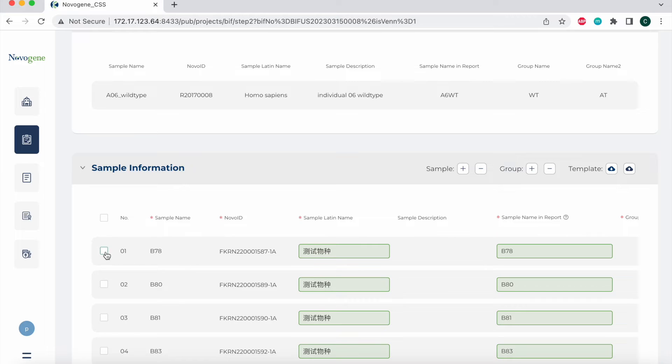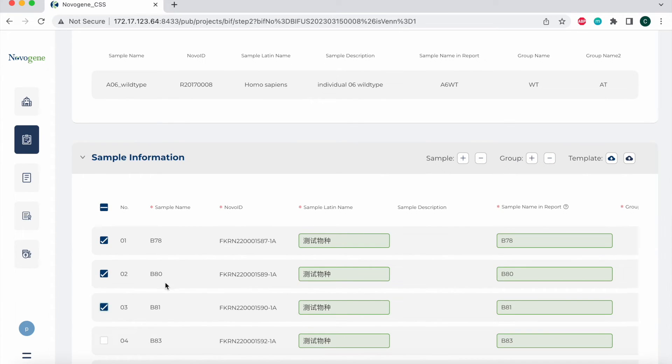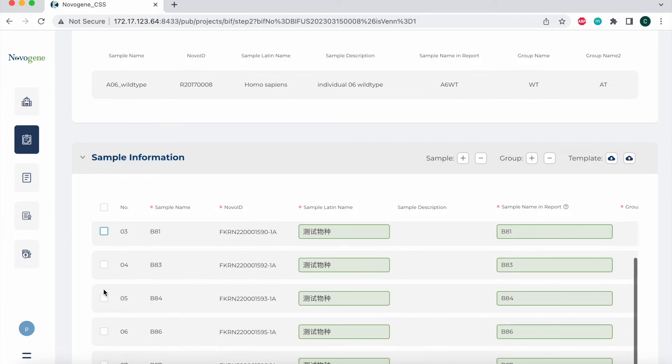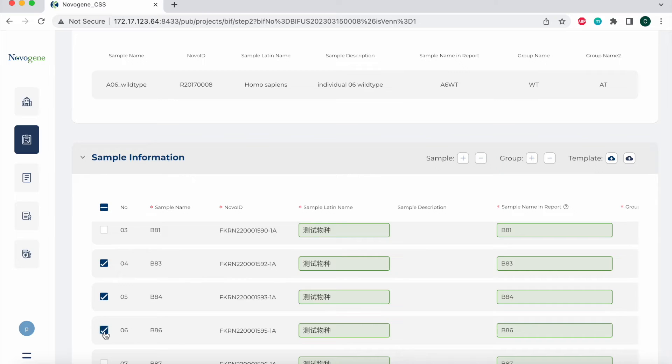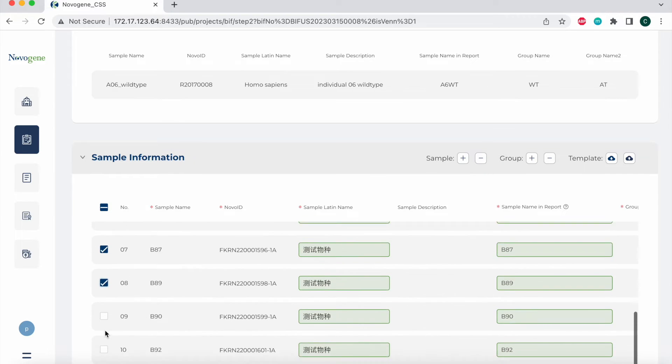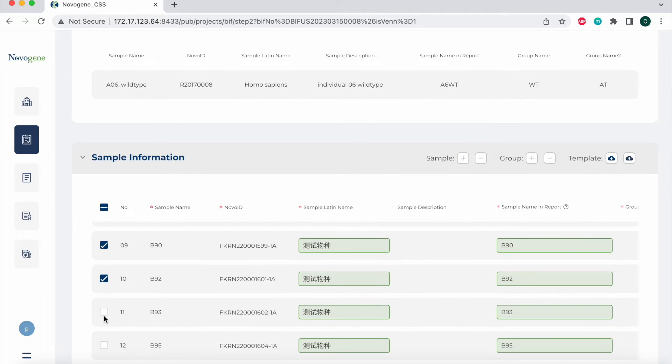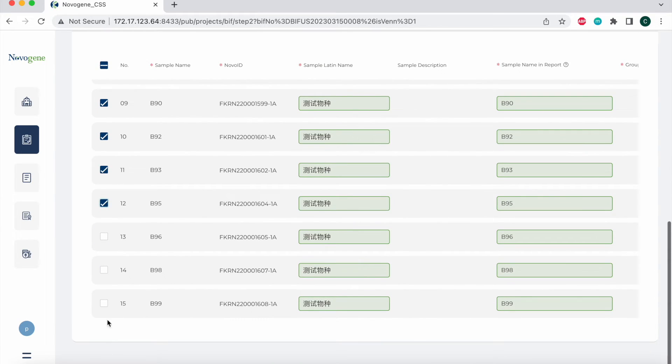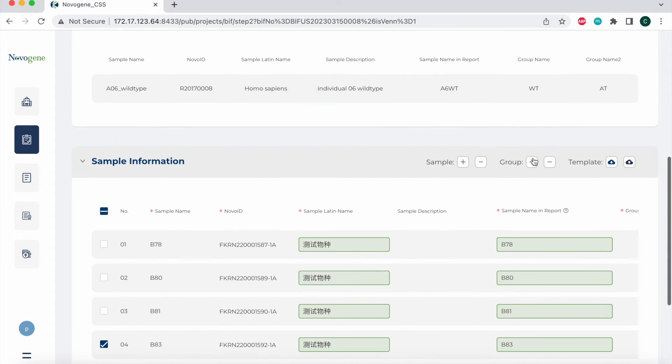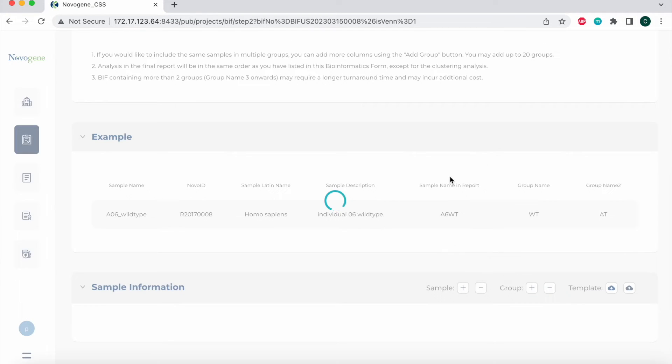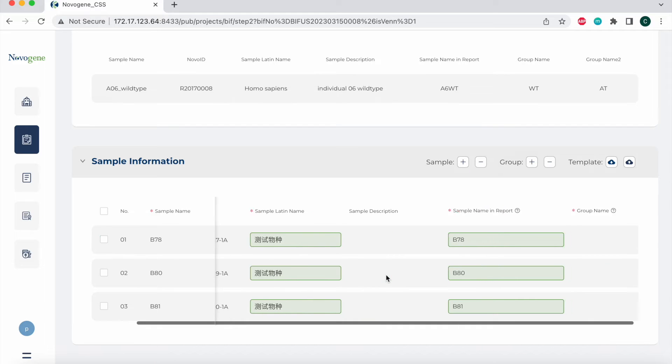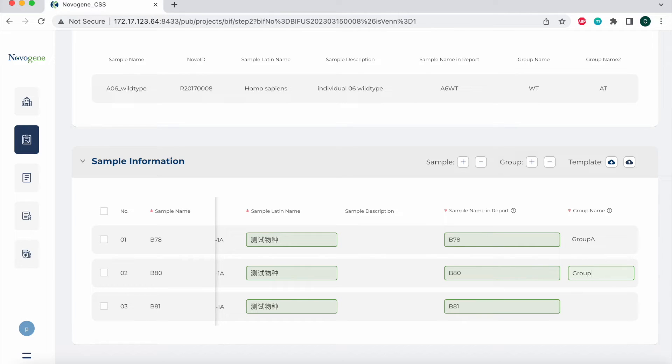So I'm going to move forward with these first three samples. Because of that, I'm going to delete the other ones. I'm going to select the other samples that I am not going to move forward with and hit minus to remove them so that I only have these remaining three. Then for the group name, I'm going to click on the section and type in the group name that I want to give each group.